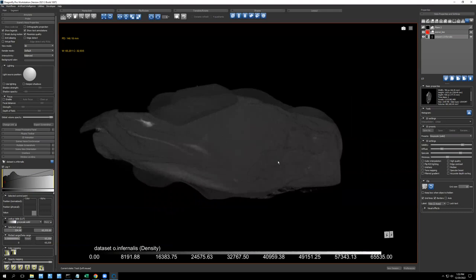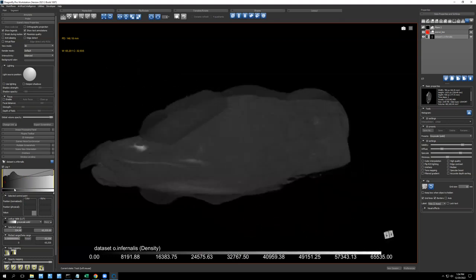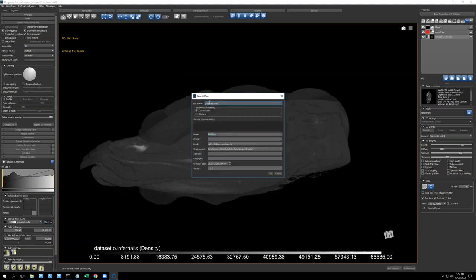You can't save them. So if you do spend 2 hours modifying that and you like it, how do you save that as a preset? Is that something that you've done clearly with all your bones? So over here it says more, and down here it says save LUT as. Give it a name. You're the author. And if you want, I'm not sure how this changes based on your license, but it's either current user or all users.